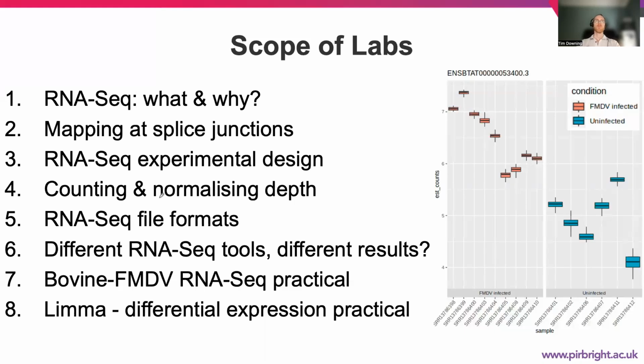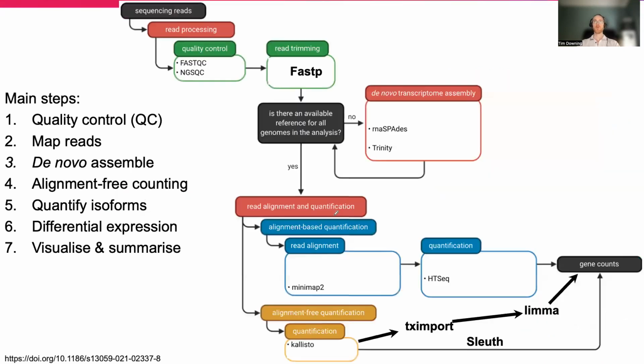So welcome to this video 4 of course G06 on transcriptomics and RNA-seq. We're looking at counting and normalizing depth in this part. To follow on from our outline for the library preparation and sequencing approaches for RNA-seq data, we can also consider the steps for our general pathway for bioinformatic analysis, though obviously it depends on what you're looking at to a large degree as well.